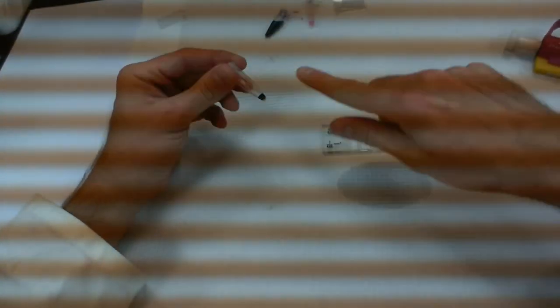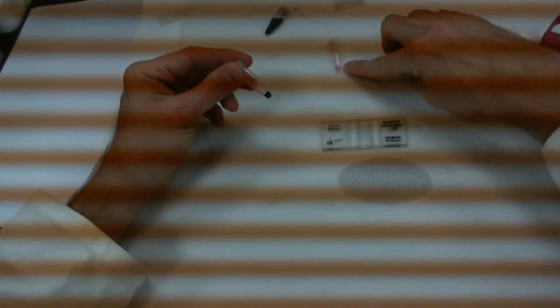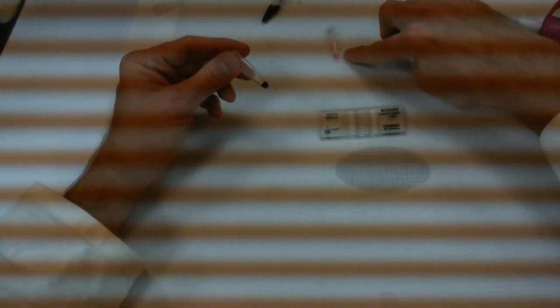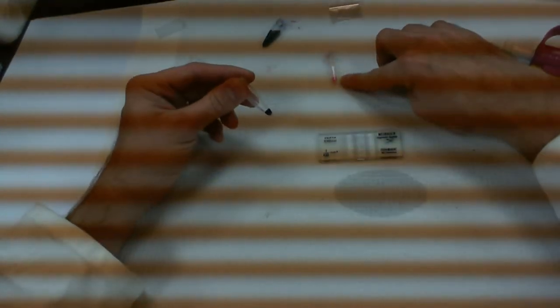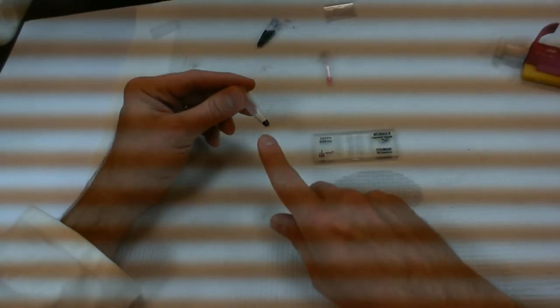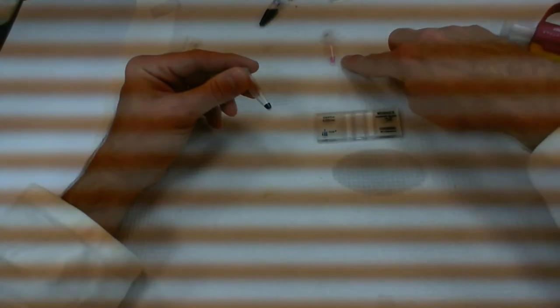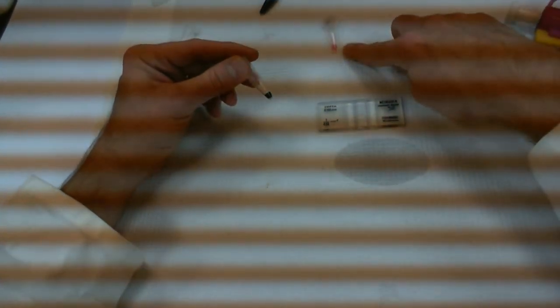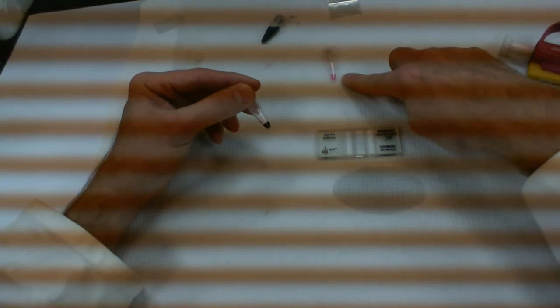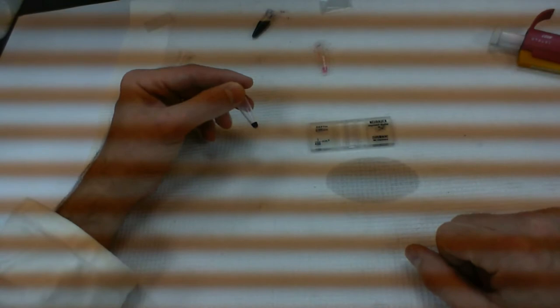So keep in mind again that this is half of the concentration of here. This is the original sample. This is what you want to know the concentration of. You want to know how many cells per milliliter there are in this tube. What you're going to find out when you do your cell count is how many cells per milliliter you have in the diluted tube. So you're going to first do the count for this, and then you're going to convert that concentration to the original by multiplying by the dilution factor. In our case, the dilution factor is 2 times. If we use a different amount of trypan blue, we will be looking at a different dilution factor, so you're going to have to figure that out for yourself if you're ever doing this with a different dilution factor.